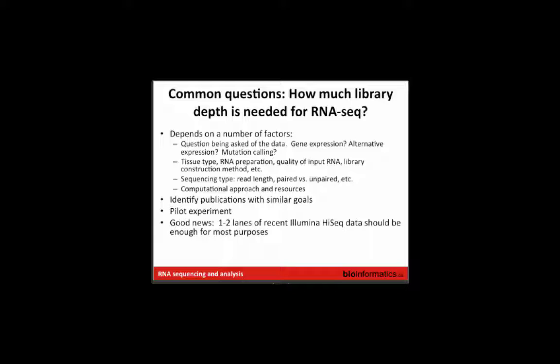But yeah, so these two recommendations are sort of what you should really do, which is to think about what your analysis goals are, and to look at what other people have done and see how well it worked for them. And even better than that, do a pilot experiment. So sequence maybe deeper than you would like to with a few samples and get a sense for what the result is like, and then try to dial it back to where you feel like it makes sense.